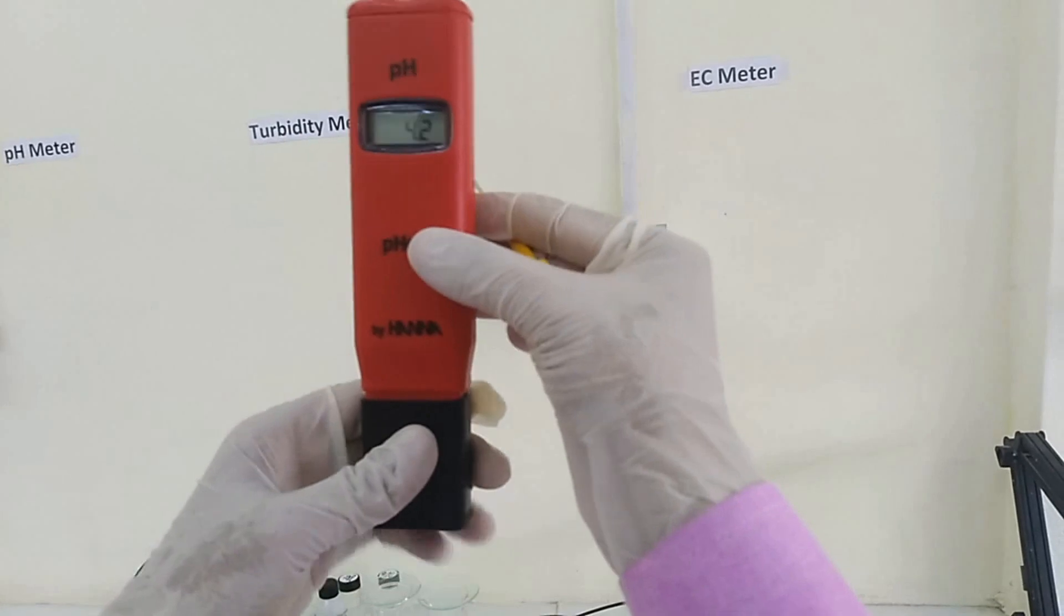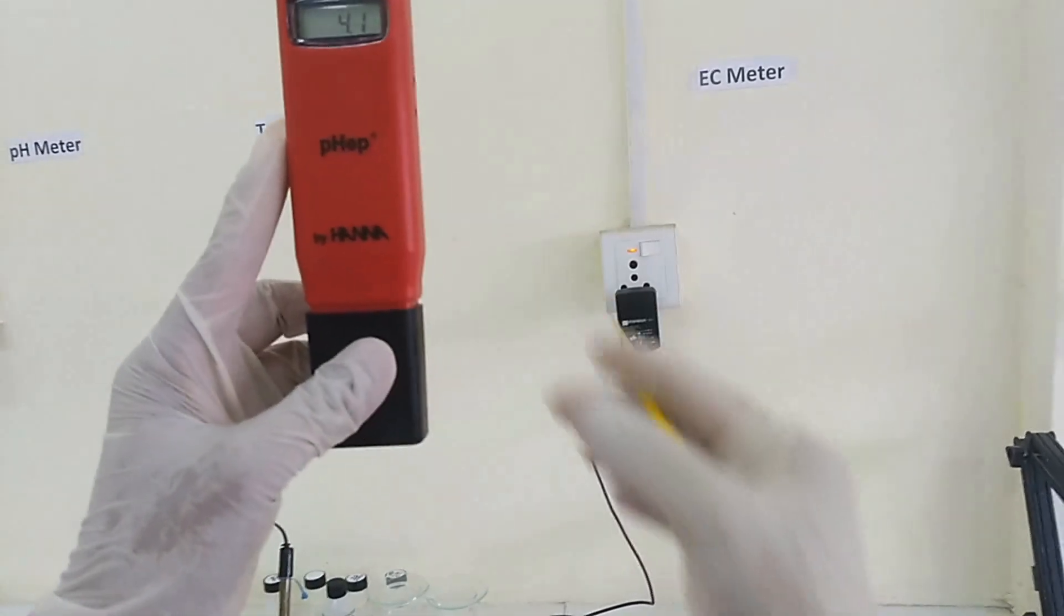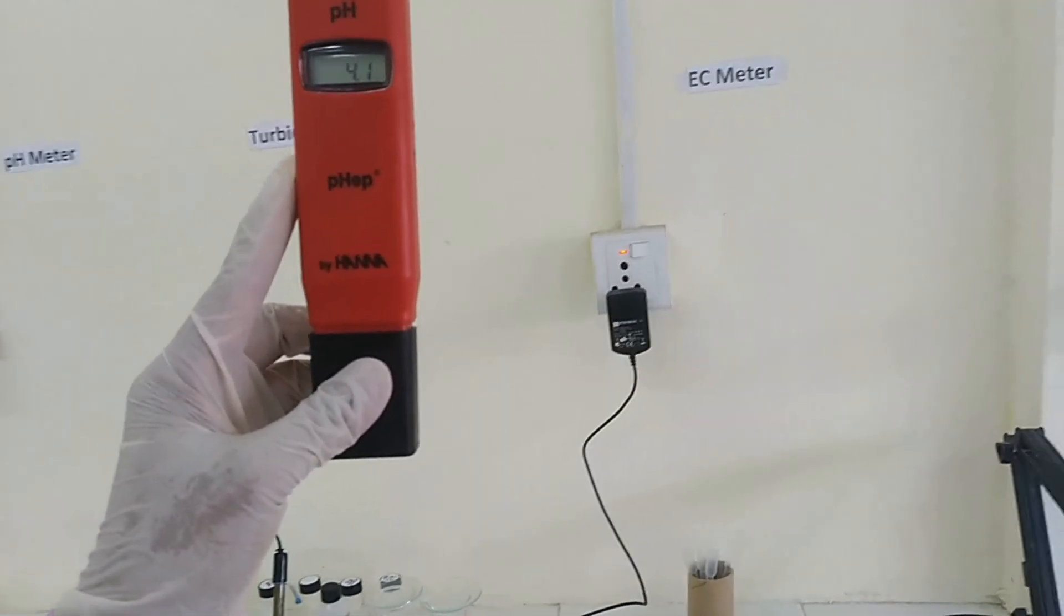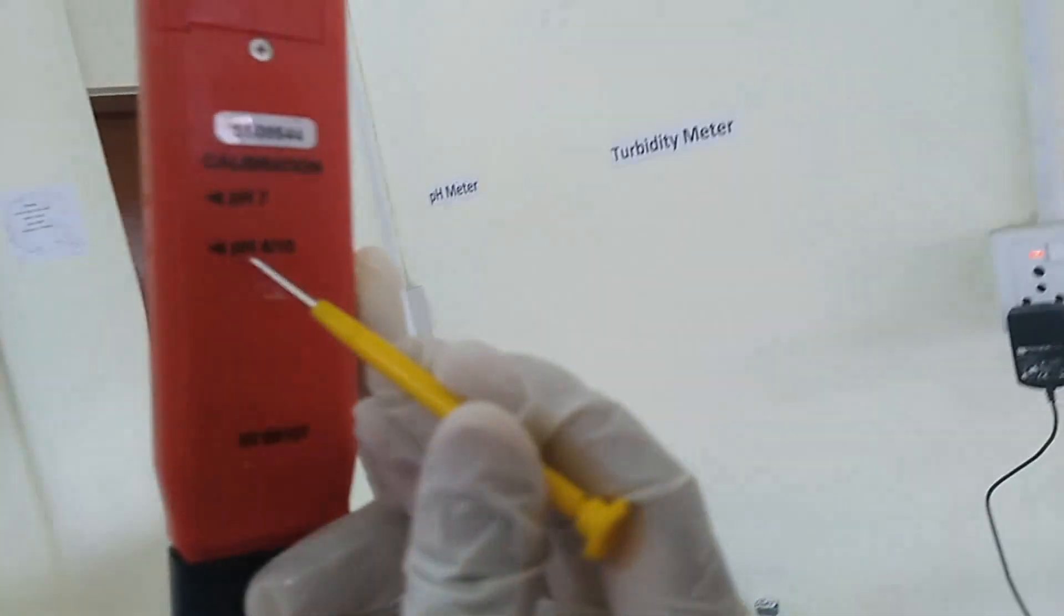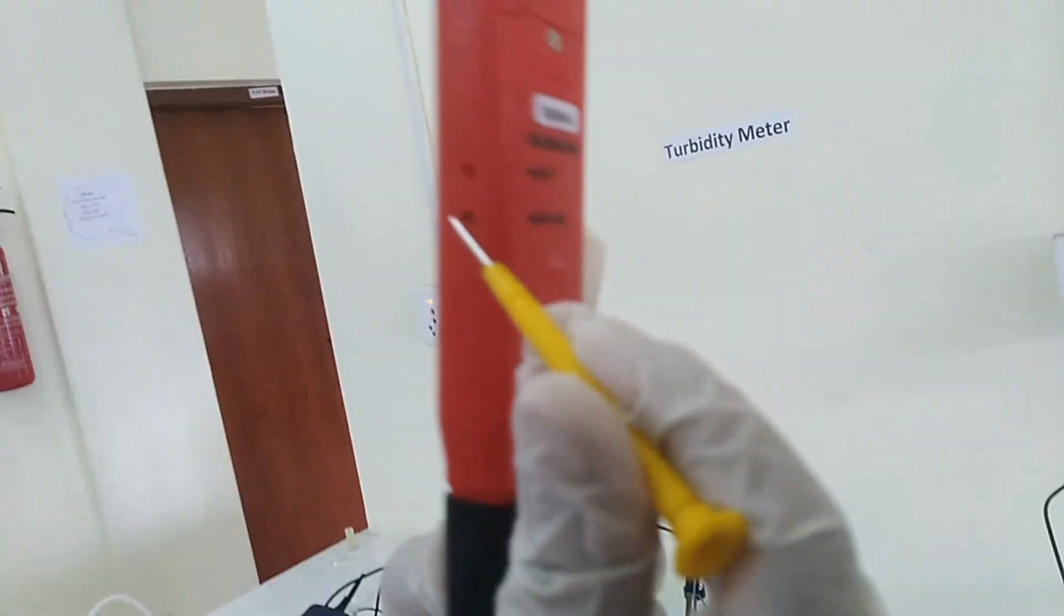Insert screwdriver to the hole corresponding to pH 4 or 10. Slowly rotate screwdriver and make value 4. Note that clockwise rotation increases the value and anticlockwise decreases.